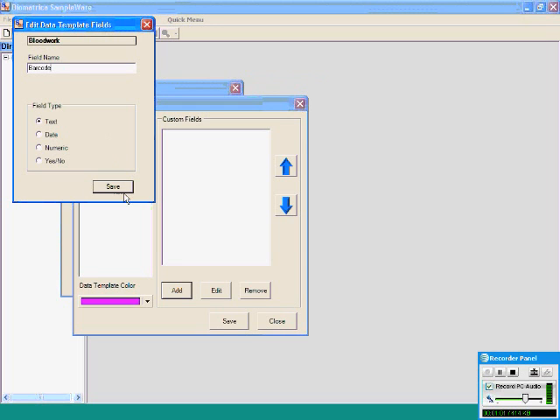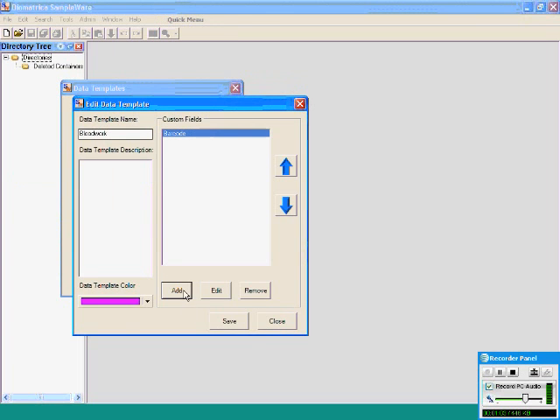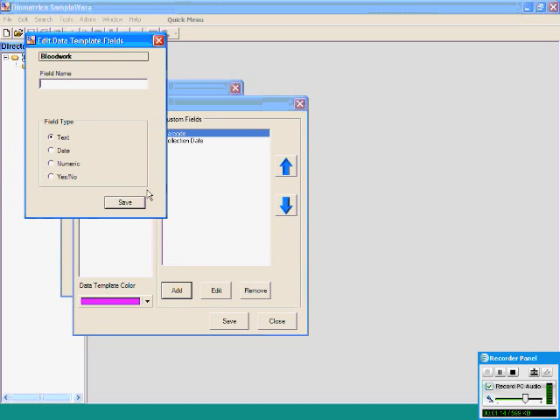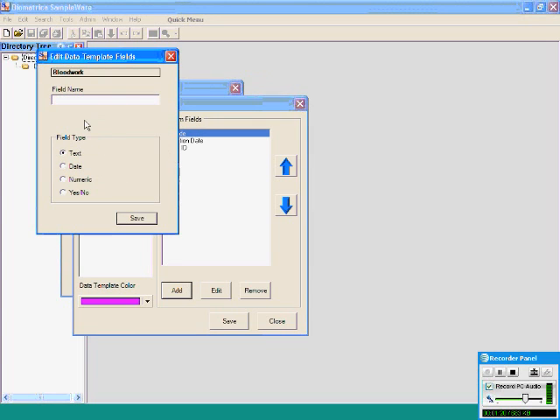There's a barcode that will uniquely identify each sample. I will then want to store several parameters that describe the actual blood sample, including the collection date, the donor ID, and the blood volume.